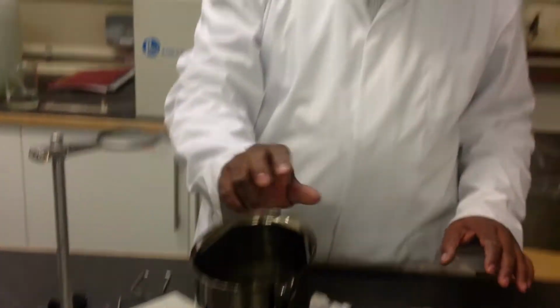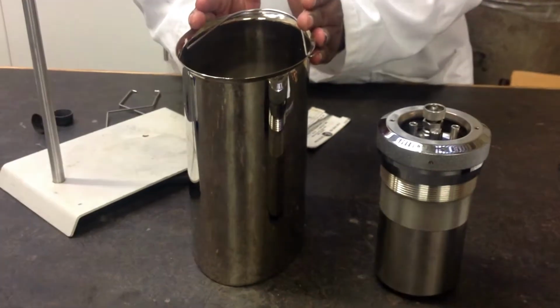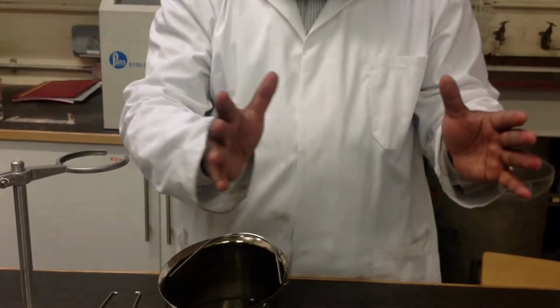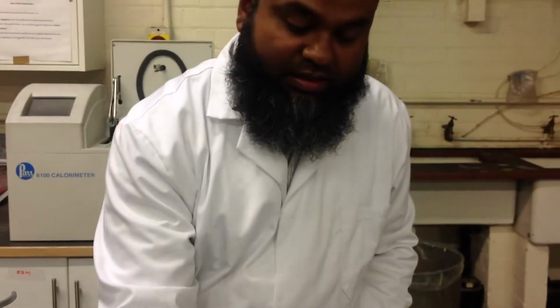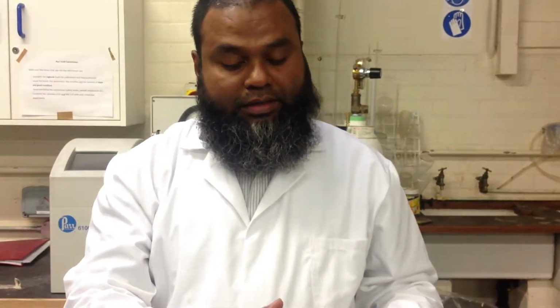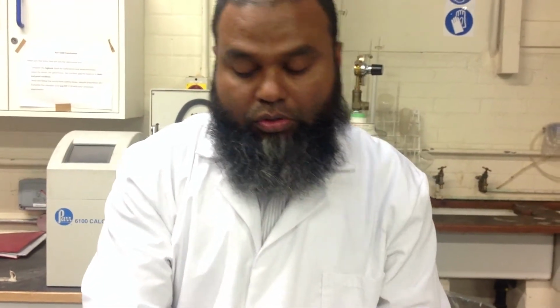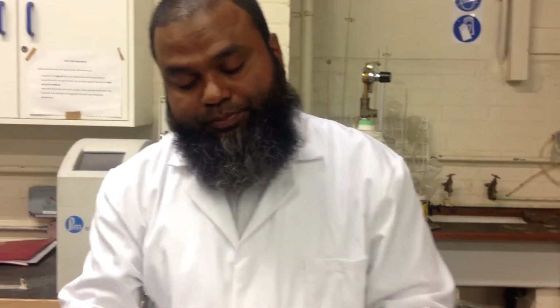We put the whole vessel into the bucket, at the center of this bucket, and after some time the combustion takes place inside the bucket, the fuel burns, and the energy liberated due to the burning of this fuel goes into the water.